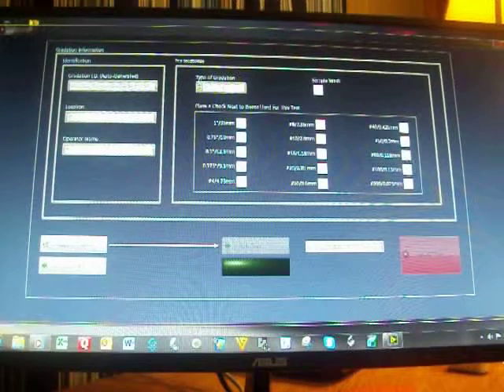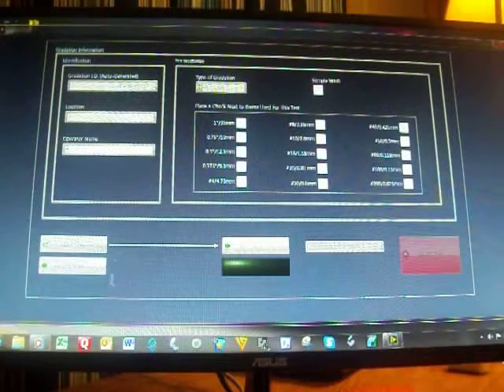Automatically selects the pan. And now we check to see if we have complete data for a test. And the software tells us that the information has been accepted. We're ready to test. That enables our Run Test button.